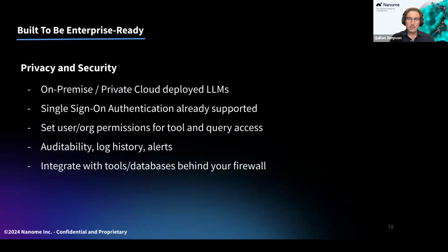This avoids any of the concerns related to leveraging large language models or big data capturing your data. You are always in full control of your data when utilizing Mara in an enterprise version. So what that provides is secure access with all of the features needed to be enterprise ready: single sign-on functionality, organizational permissions for controlling which tools and querying accesses your scientists have access to, as well as the auditability and log histories that I showcased earlier.